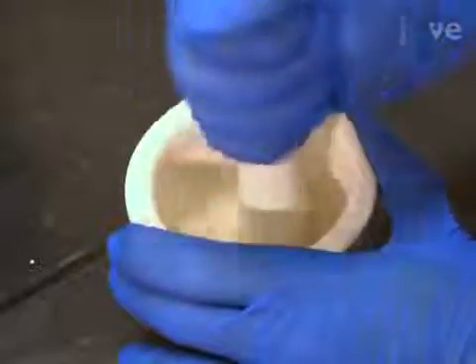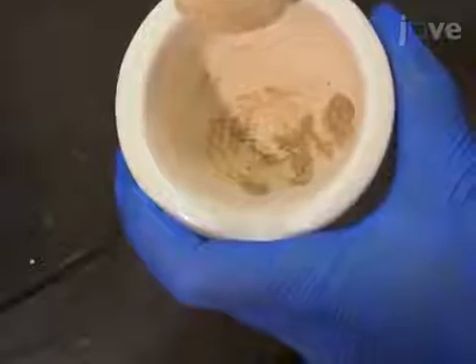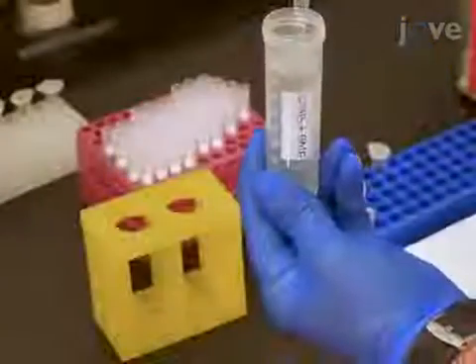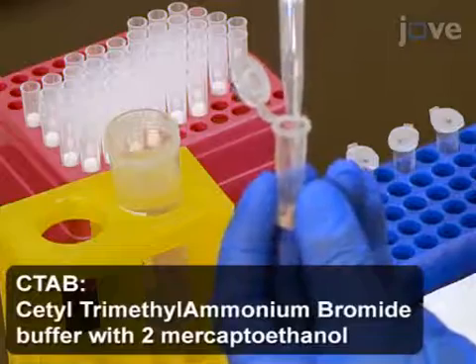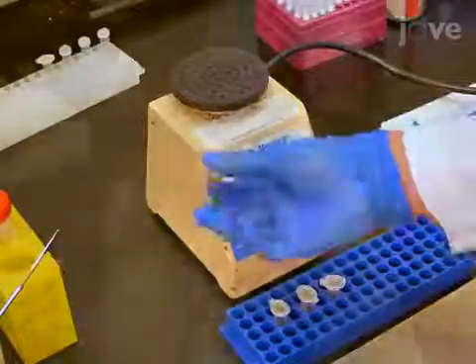Next, add the frozen powder to two 2-milliliter tubes, filling no more than half of the tube volume. Then, add 600 microliters of warm CTAB solution to each tube. Thoroughly mix the powder by inverting and vortexing.